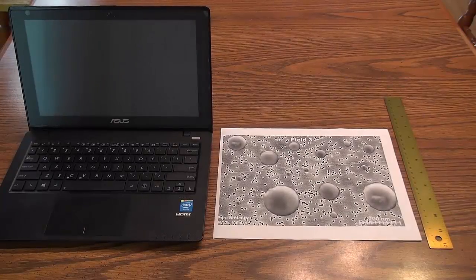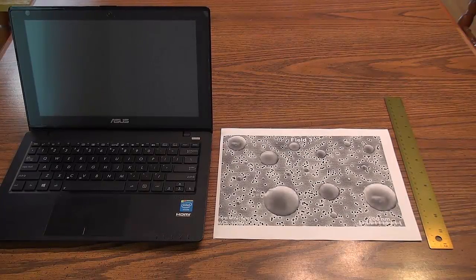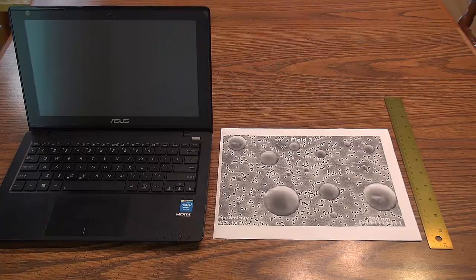For this activity, you will need SEM images printed out for each group of students, metric rulers, and computers with Microsoft Excel.